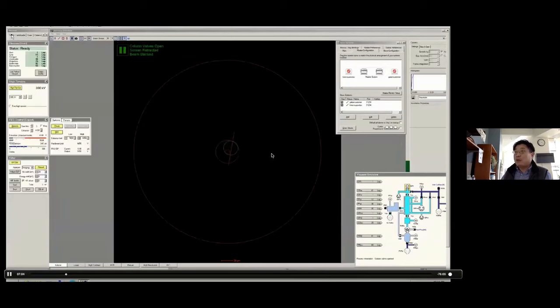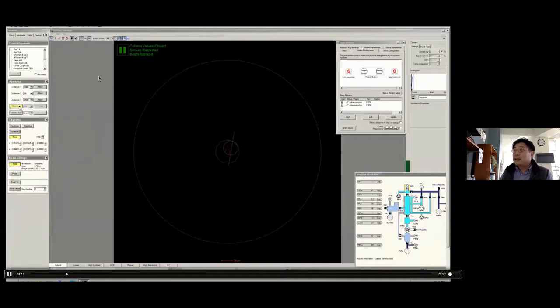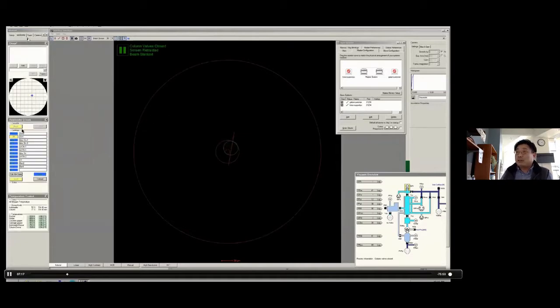so here we are switching to another monitor. So this is a big jump. This is the Titan computer. So we turn off the objective lens, then switch. This is the auto loader. We switch it from 11 to 12 grids. Then I call load, and this takes a longer time. So there's a big jump here.